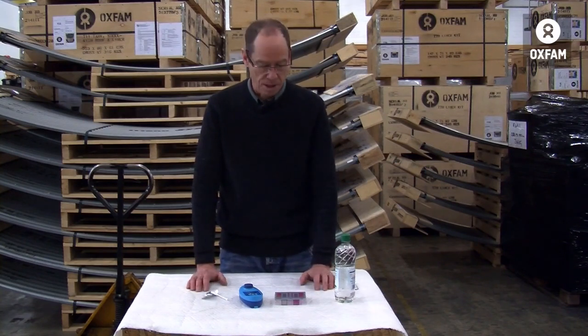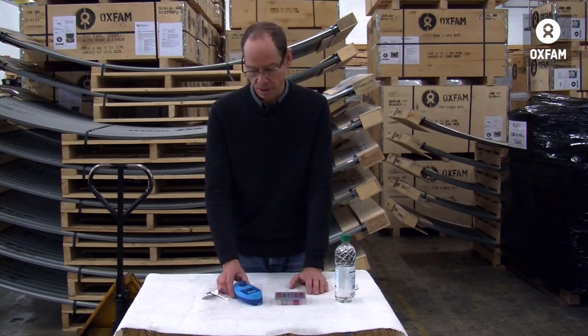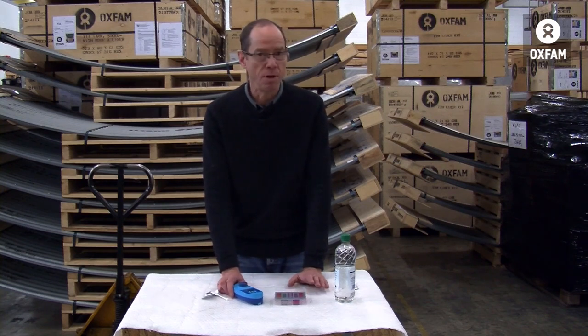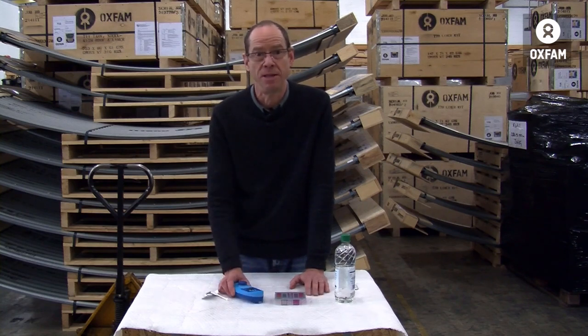Two simple methods. The pool tester, very cheap, easy to use, quick, but ambiguous, slightly inconsistent results. Certainly between users you'll have some variety. And a photometer. Very simple to use again, more expensive I understand, but if you've got people who aren't accustomed to measuring chlorine and you want the results to be right, use one of these. Or if you're the team leader and you want to check the results of your team that are going out and measuring and make sure they're all accurate, this is the kind of thing you want to have handy in your backpack.